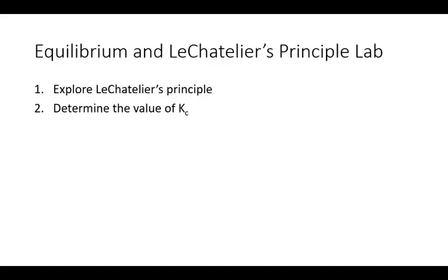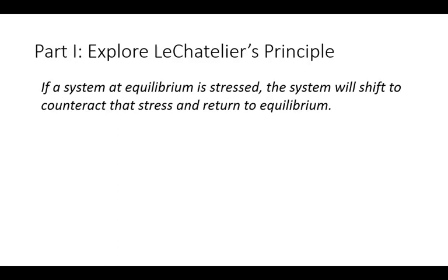So our remote lab this week has two parts. The first is to explore LeChatelier's principle, and the second is to determine the value of Kc for a particular reaction. So in the first part, we will explore LeChatelier's principle together.